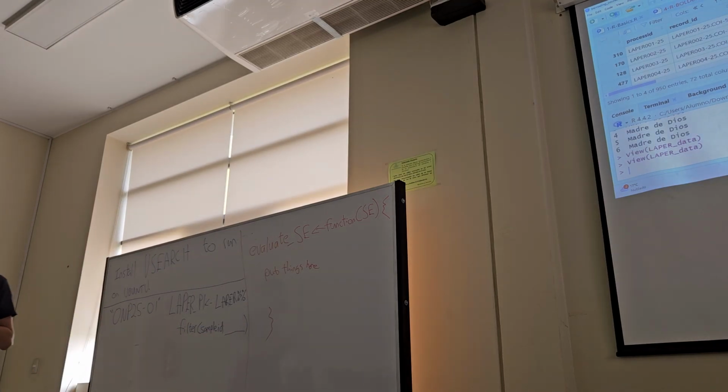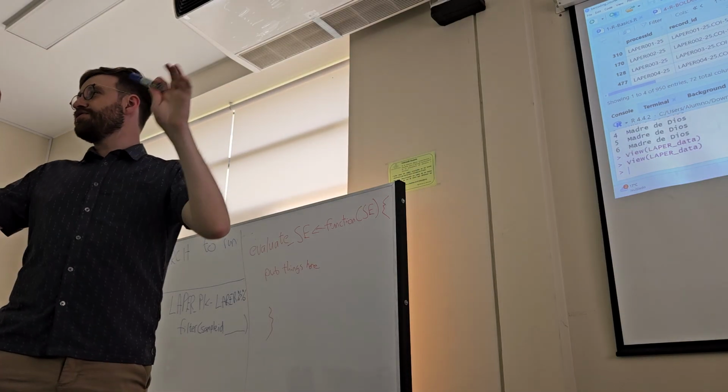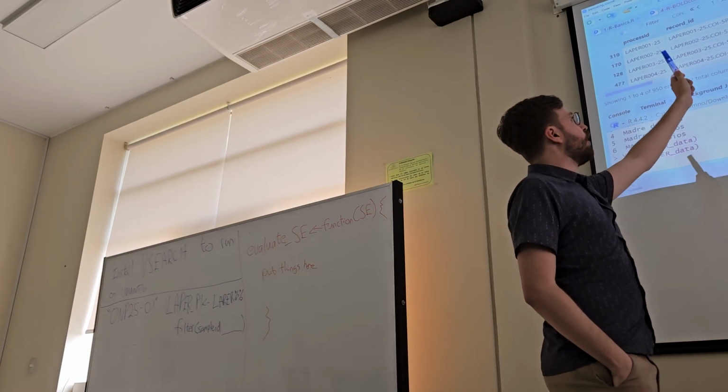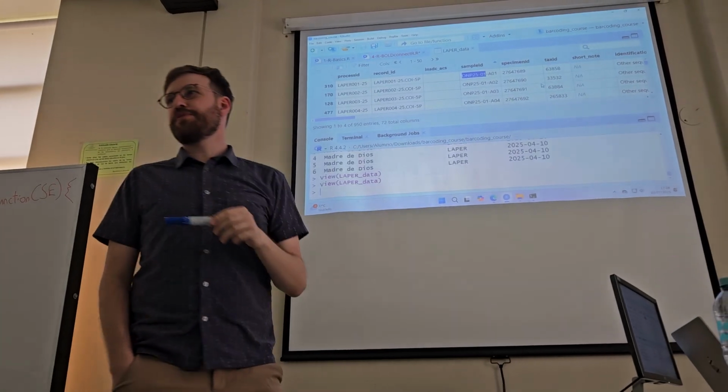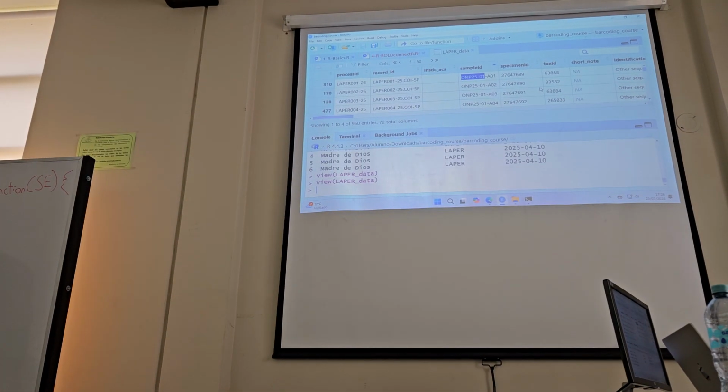You want to filter. You can use ChatGPT, this is an example of a thing you want to do, you don't know how to do it, so let's figure it out. Sample ID, you want to keep the ones that start with, hint, there might be a function called starts_with, maybe look at that. Starts with those letters, ONP25-01, okay? So use filter to keep the sample ID. You can do equal, something like this. So see what you can do. Do some Googling, typical exercises. If you don't know how to do it, Google, see if you can figure it out.